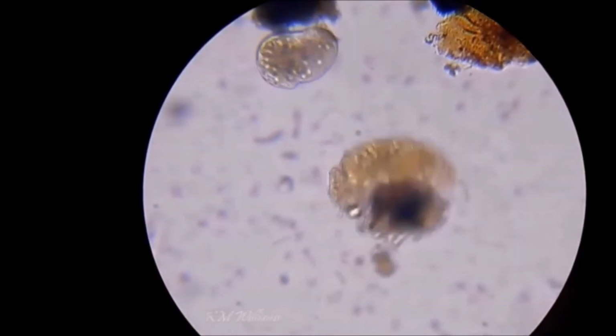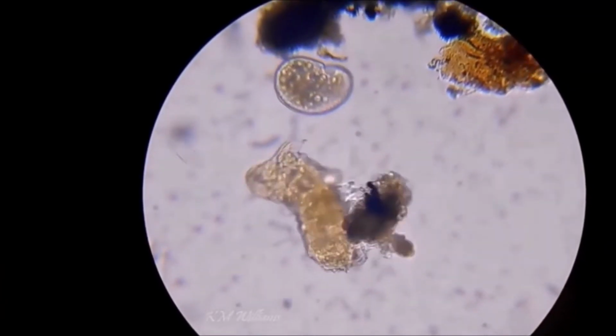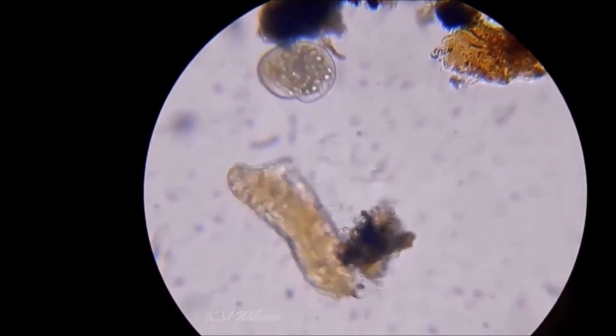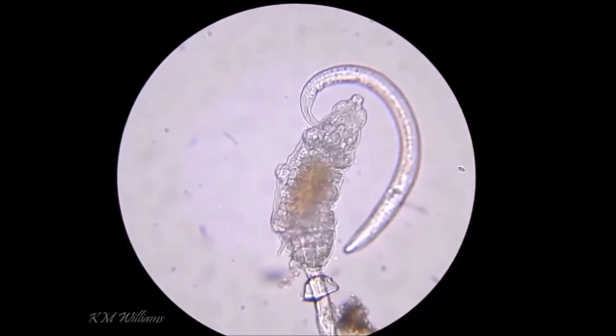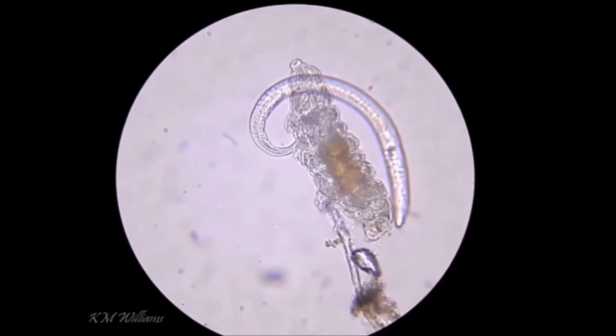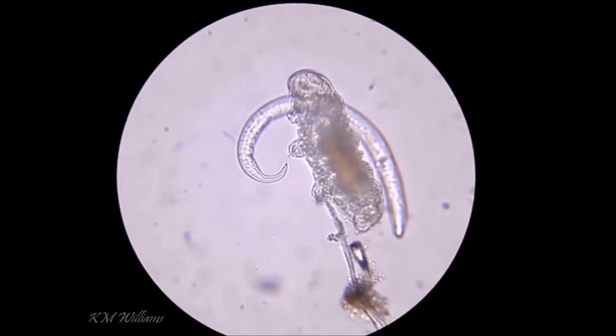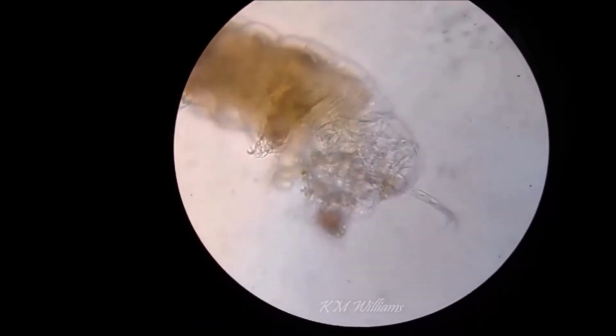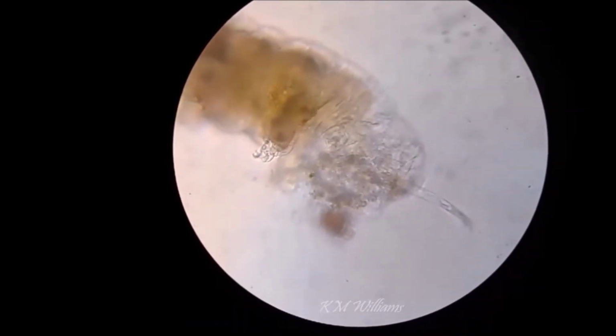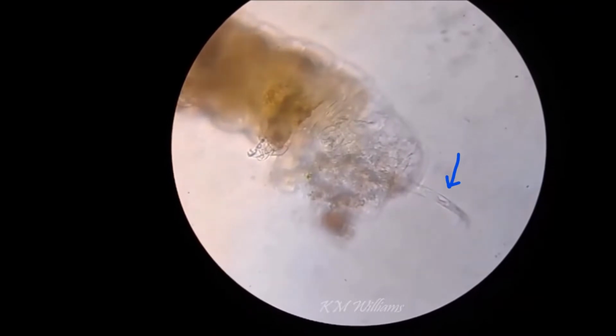So I really love watching tardigrades interact with other microorganisms. It's really quite interesting. In this video I took recently, you can see a tardigrade getting all tangled up with a nematode worm. It's quite funny. But back to this tardigrade from last year, it was the first time I'd seen one eating a nematode worm. So you can see the worm sticking out of its mouth here. So I was very excited to watch it.